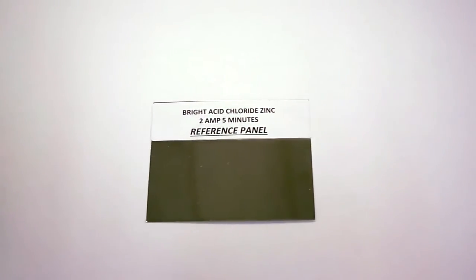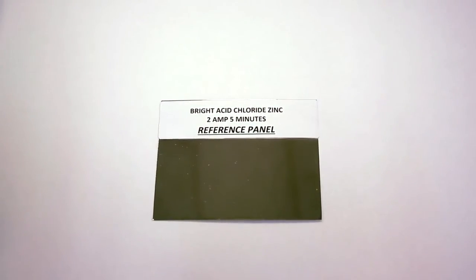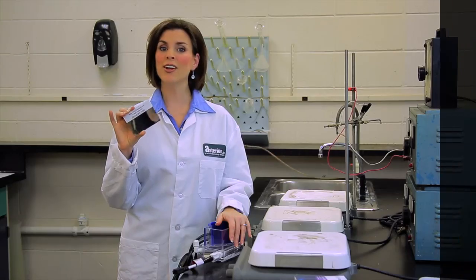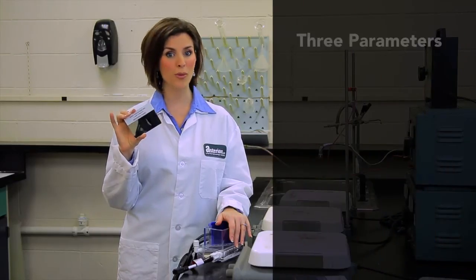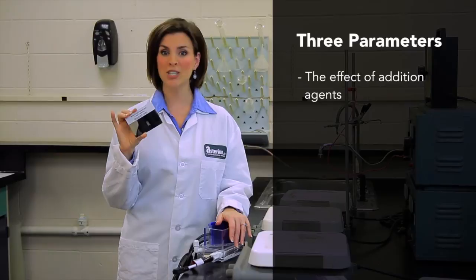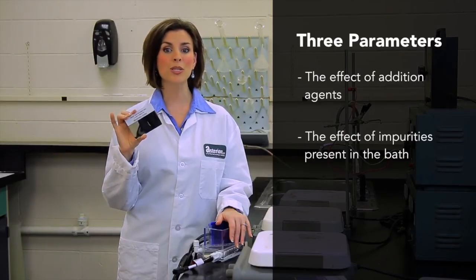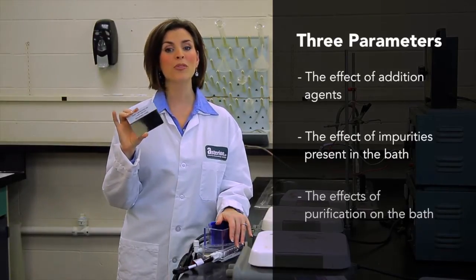A completed hull cell panel shows the range of deposit across a wide range of current densities. The completed hull cell panel provides data on three parameters: the effect of addition agents, the effect of impurities present in the bath, and the effects of purification on the bath.